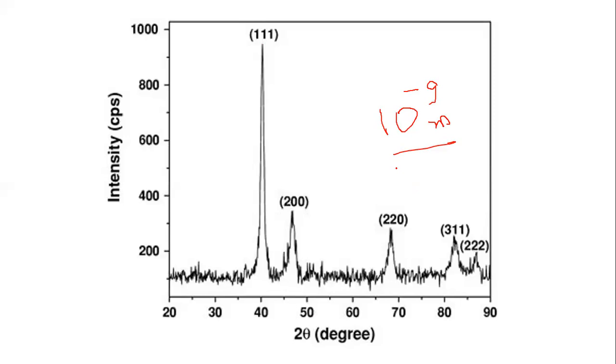And originally this is the spectra of palladium nanoparticles. So it means the particle size is in the range that I have written here, 10 raised to the power minus 9 meter, or nanometer. So the particle lies in this range. Is it not very interesting that we just recorded the spectra and we understand the particle is crystalline in nature? And you know, you have studied in your previous classes what is crystallinity and what is amorphous.